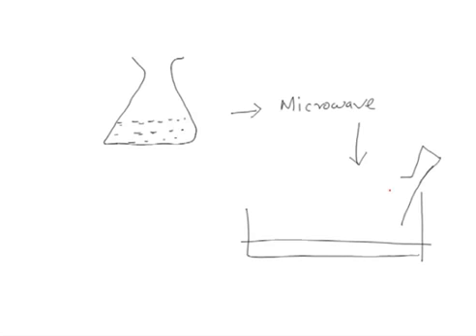Once it is done, there is a comb. What is a comb? A comb looks something like this. These are slots here. It looks something like this. So, this comb goes into the gel, and these areas will be vacant, or wells will be created.